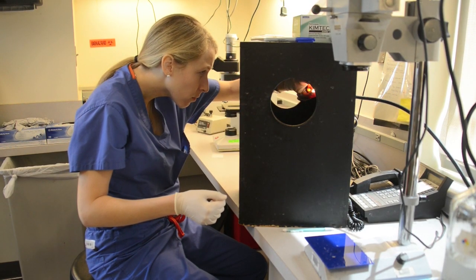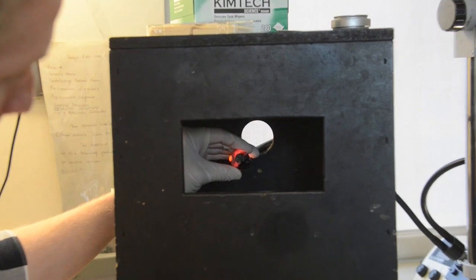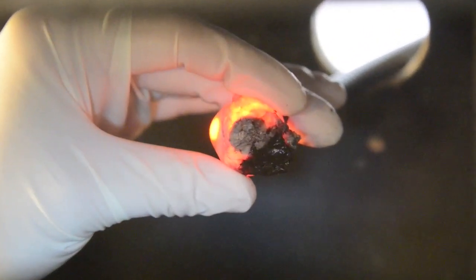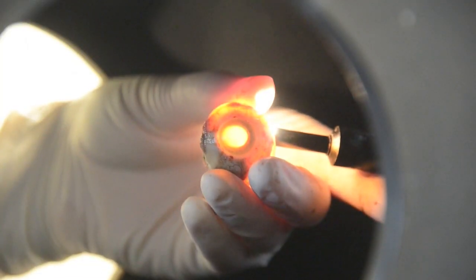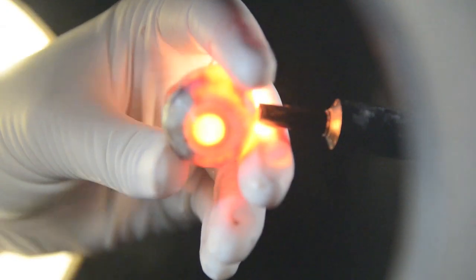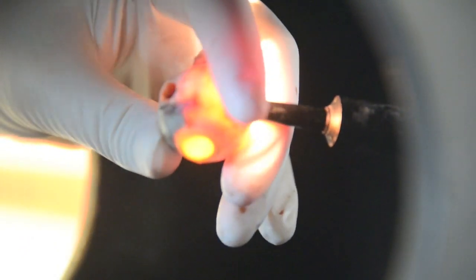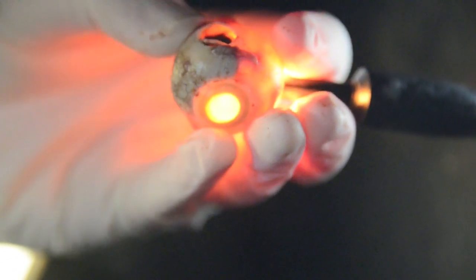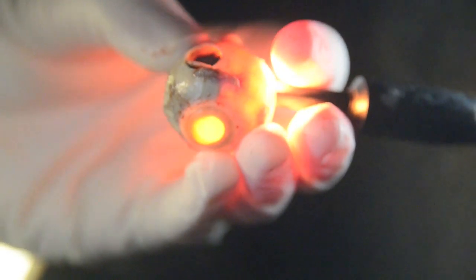The eye is transilluminated using a special transillumination box. To perform transillumination, the globe is rested directly on the tip of a bright fiber optic illuminator. The globe is rotated on the surface of the light to disclose a tumor shadow. This eye with a uveal melanoma has a tiny scleral site that was used to harvest fresh tissue for genetic studies after enucleation.